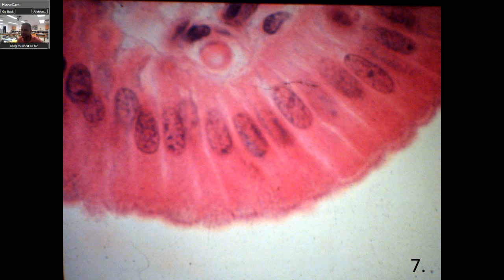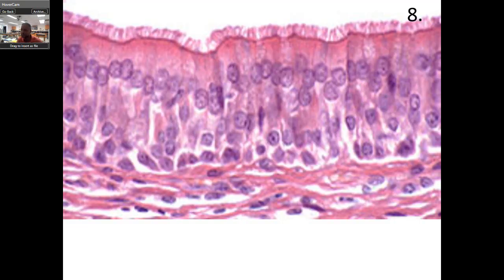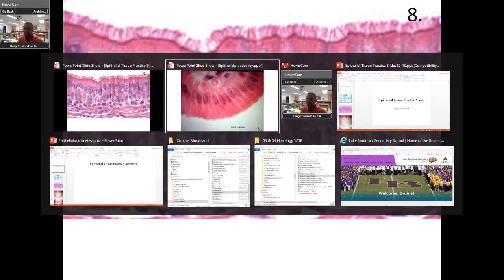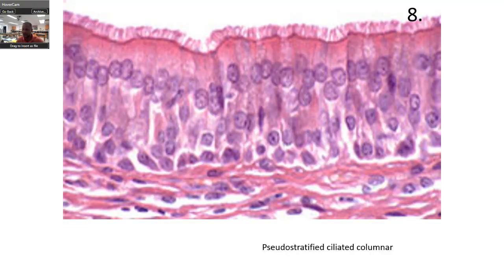Take a guess — pseudostratified. This is interesting because this is a whole row of cells. Look at the nuclei — they're in different locations, giving the illusion of a stratified layer, but from here down to here is one layer. This is right underneath — this is the basement membrane. Here's your apical surface, there's your lumen.